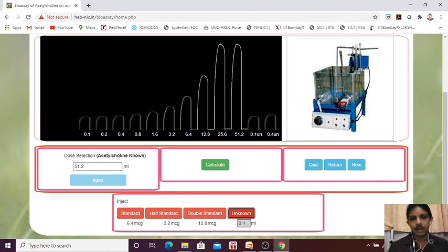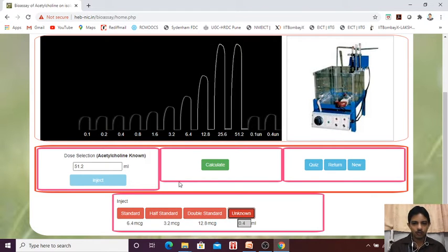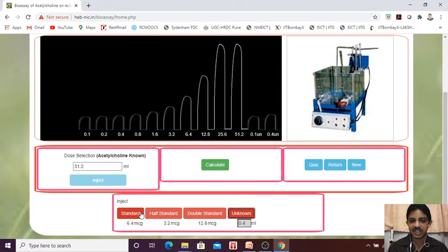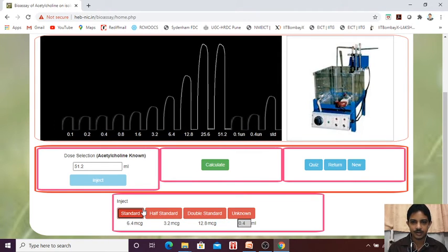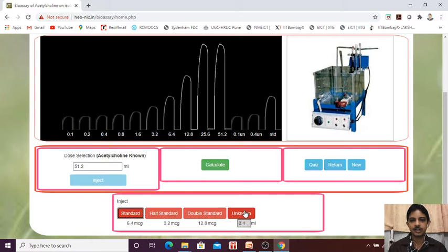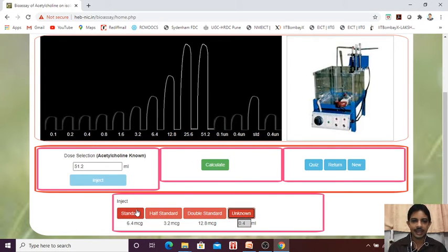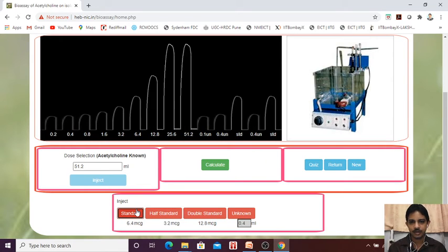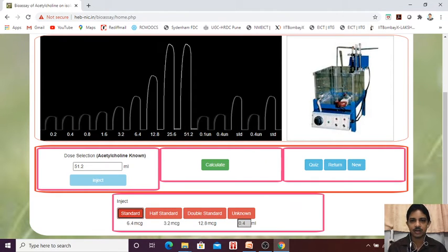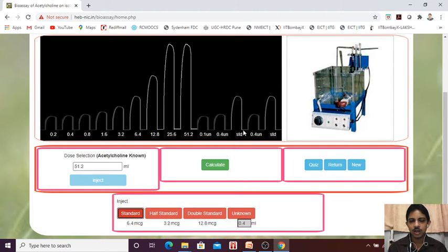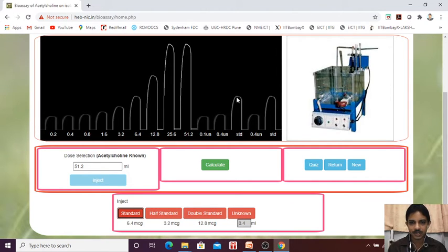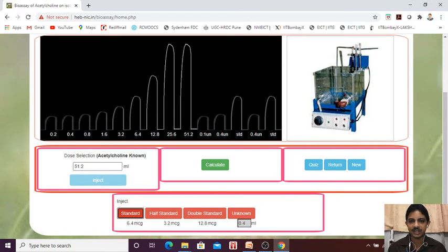What you are going to do, first you give the standard, inject the standard here. Standard. Next, unknown. Again, standard. So standard, unknown, standard. You can find that unknown response, percentage of response or the height if you are telling that it is less than the standard.